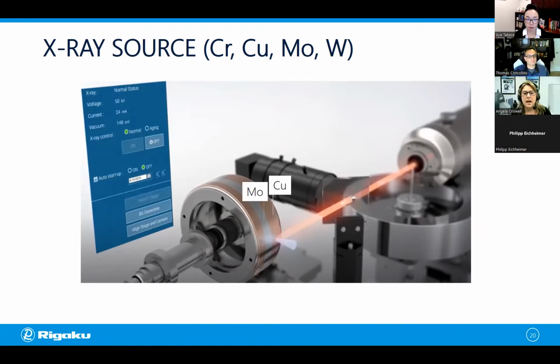It has a 70 micron focal spot size where the filament is boiling off electrons and they're focused on the target material. Here we see there's a cup of copper with a band of molybdenum. And so we have a 70 micron focal spot size here. The electrons are scattered off and they will eventually go down through our system. And in the Nano 3DX, we generally can use up to 2 different materials on a single target cup that's easy to switch. So in doing some preliminary experiments, just preparing for this, I considered which one I should use.